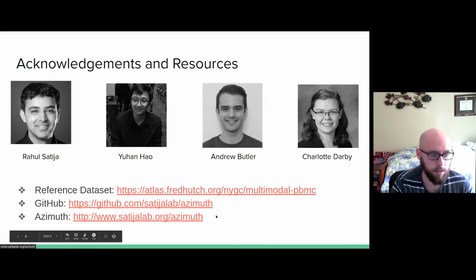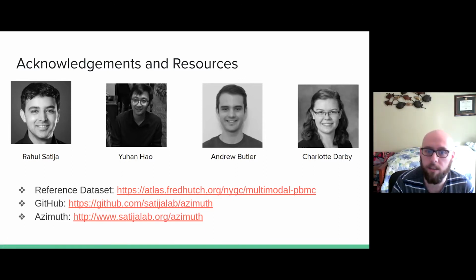And if you'd like to play with the app itself, you can go to our website /Azimuth and either upload your own data set or use the one that we provide.